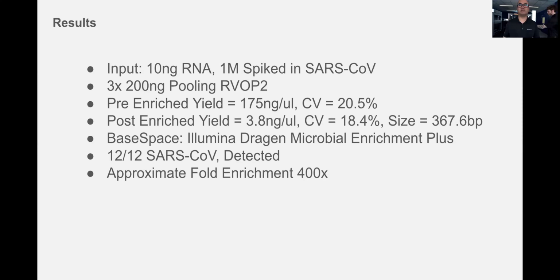I can make some user friendliness changes to the protocol, breaking it up based on how I want to approach the throughput of sequencing, what kind of input I'm using, and what depth I'm looking for in sequencing.